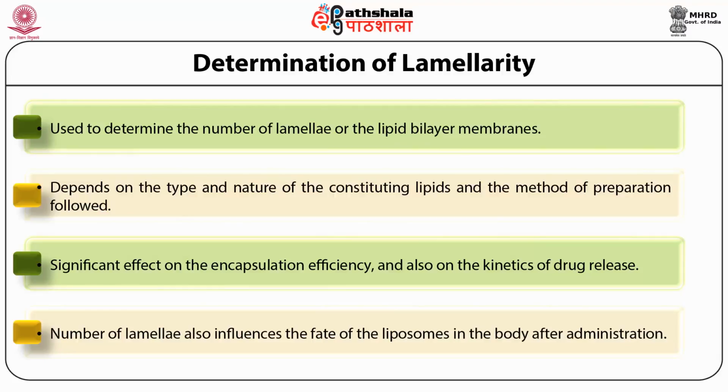Number of lamella also influences the fate of liposomes in the body after administration. Lamellarity of liposomes is usually determined by measuring the change in visible or fluorescent signal when some lipid marker reagent is added. The results are obtained when the total signal is compared with the signal achieved after the reaction between the lipid marker and the specified reagents.